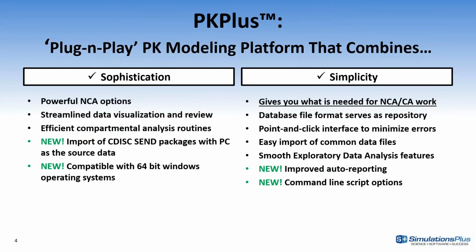Why PK Plus? We like to think that we have a combination of sophistication and simplicity that does allow you to be plug and play into the needs of your particular company. So on the sophistication side, we have powerful NCA and compartmental tools. We have a very nice data visualization tool to be able to review your data, be able to make exclusions, be able to take a look and see how you want to group the different data to make your decisions within your program. Mark will be giving a demonstration on the NCA in the data visualization, as well as the different routines for being able to output your different parts of your reporting.